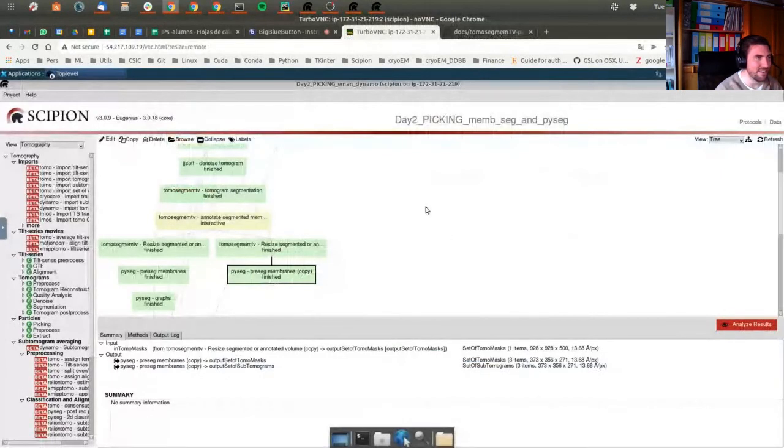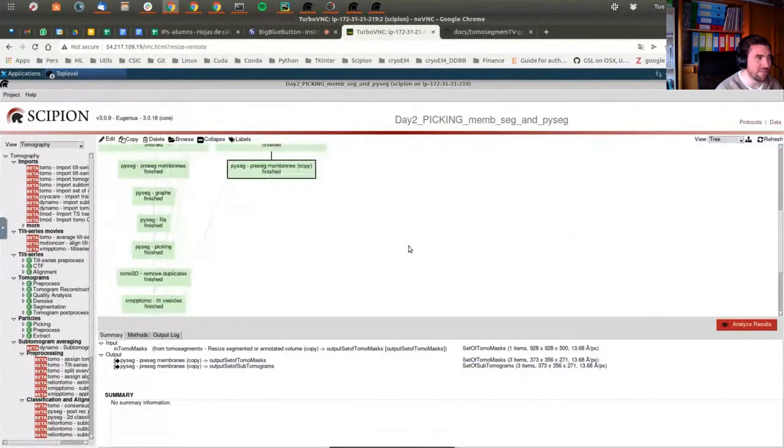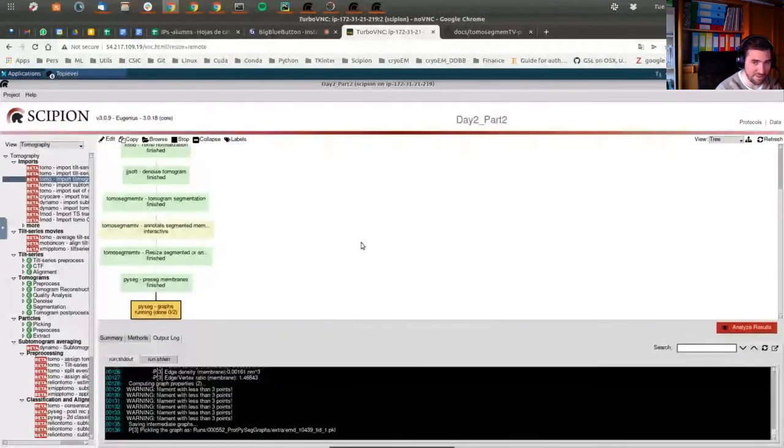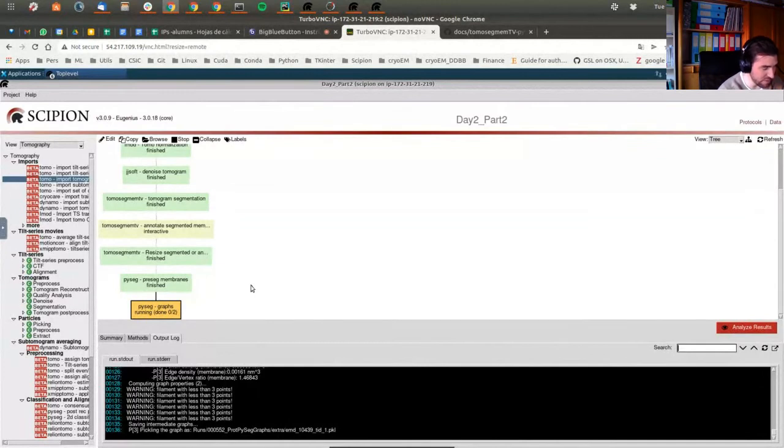Which is the latest number you have in the run standard output? Let me have a look. My number is 232. So you can see how far you're there. Yeah, quite far. Maybe I clicked before while you were explaining. I started it. Maybe. But for sure, as you can see, in my machine, it was quite fast. I don't know what's the problem in these ones.